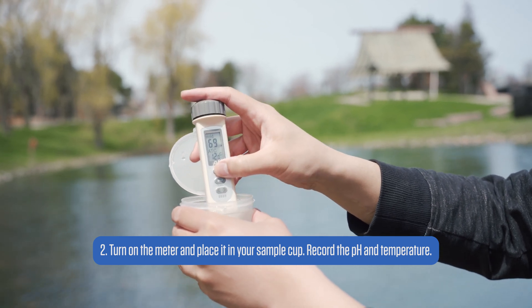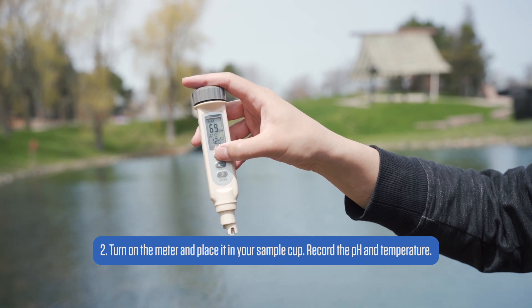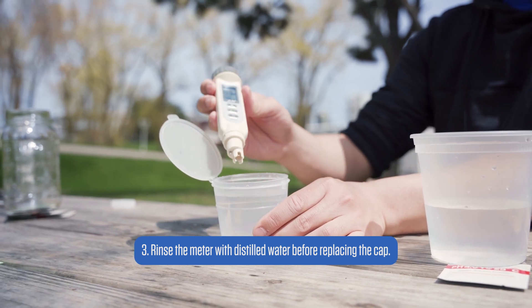Since pH is also affected by water temperature, you should also use this to record water temperature. After the measurement, make sure to rinse the probe with distilled water before the next measurement or before putting it away.